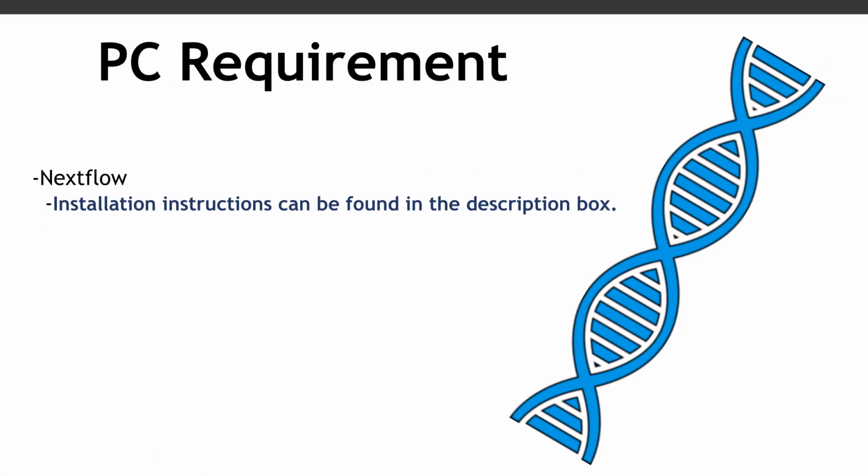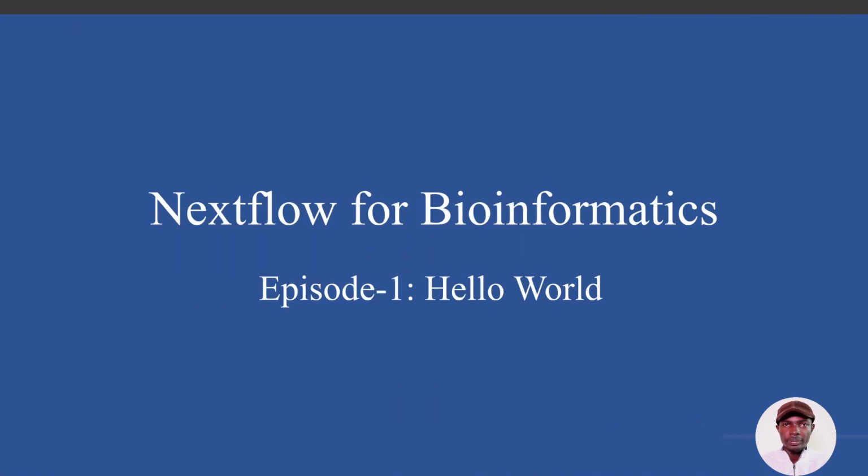Now for this tutorial, if you are going to follow, you need to make sure that you have Nextflow installed on your PC. I have a tutorial that shows how to install Nextflow in Linux. So check the description box and you'll find a link to that video. Once you are done with it, then you can start the tutorial. So let's get started.